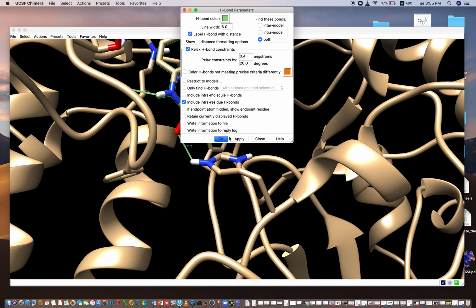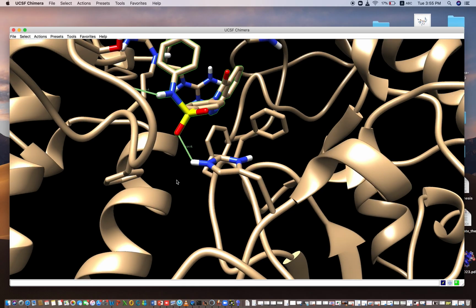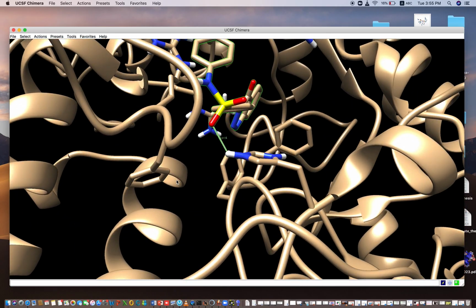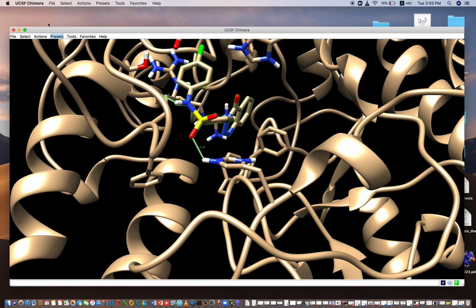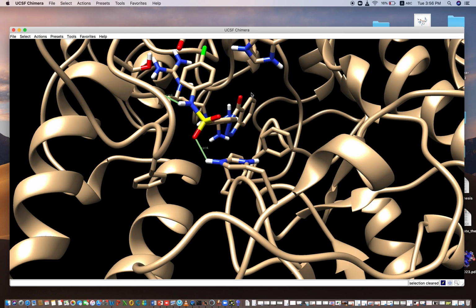There are many things you can do with this. I'll make a separate video on Chimera and how you are going to analyze the results in Chimera as well. But in today's video, I'll show you something important.